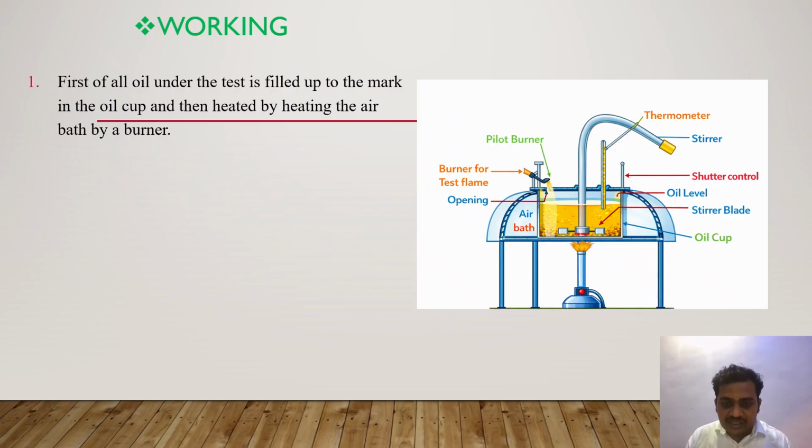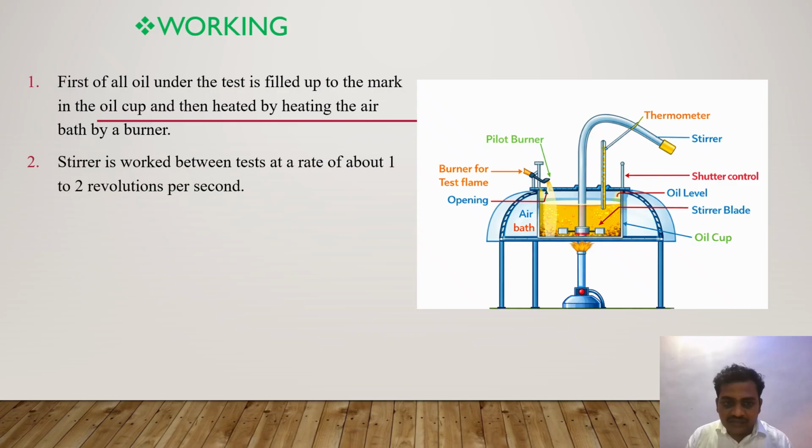In the second step, we are stirring the oil in the oil bath with this stirrer at the rate of 1 to 2 revolutions per second.